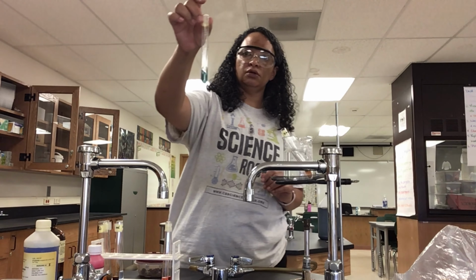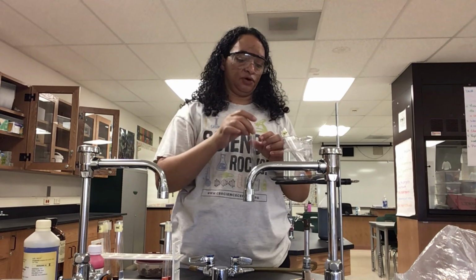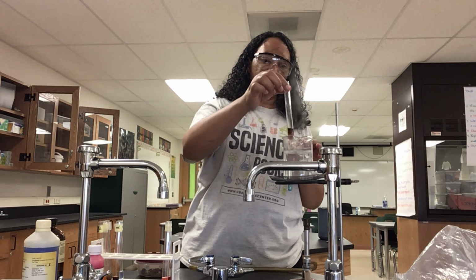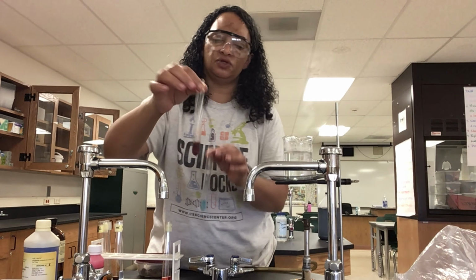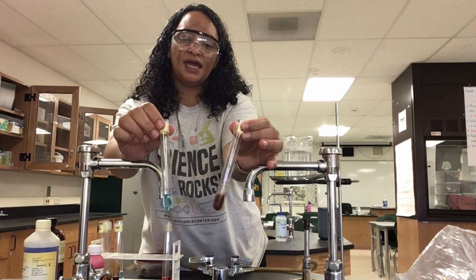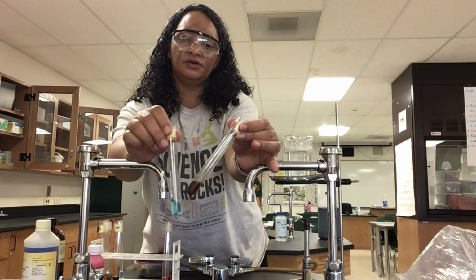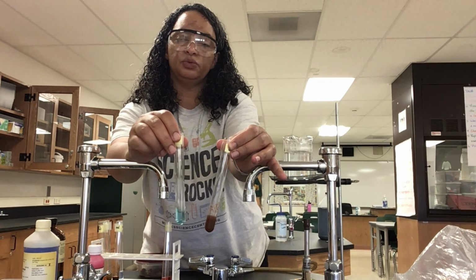So here's our control. So this is our sugar test, remember, our simple sugars. So here's our control, still a light blue and only mildly hot. And then here is our test tube. So we can definitely see, hot, that there is a change. So we went from this nice blue color to this kind of rusty orange color. All right, so we definitely see a color change. What does that mean?